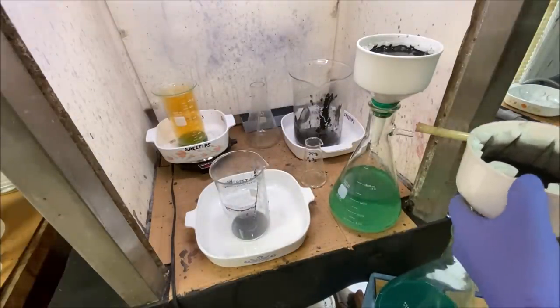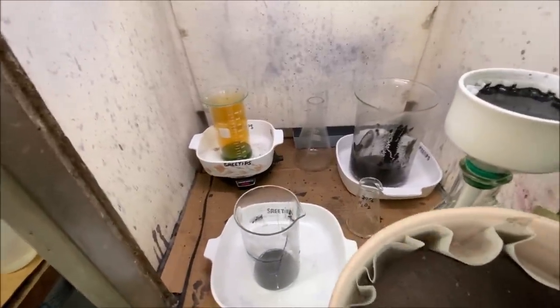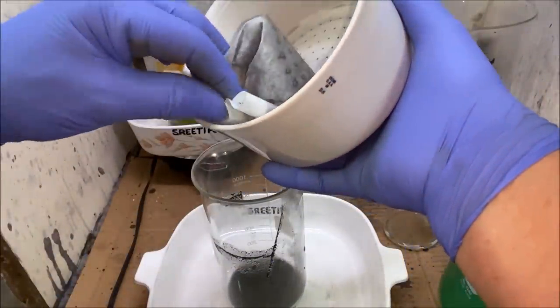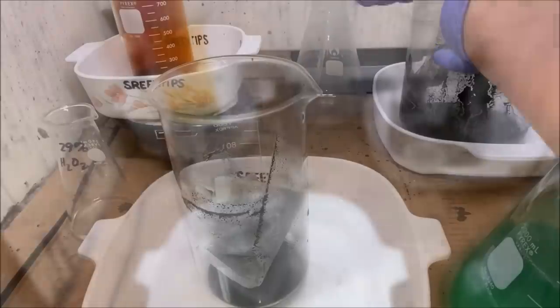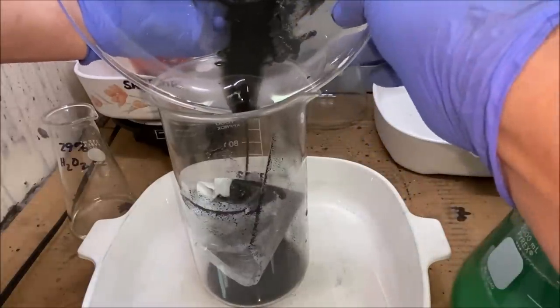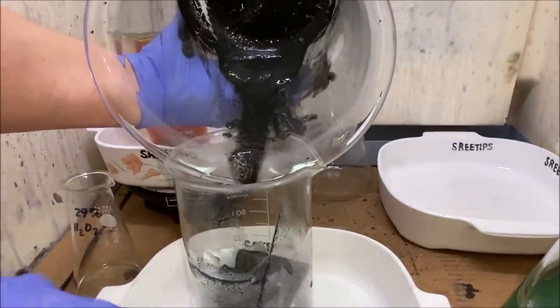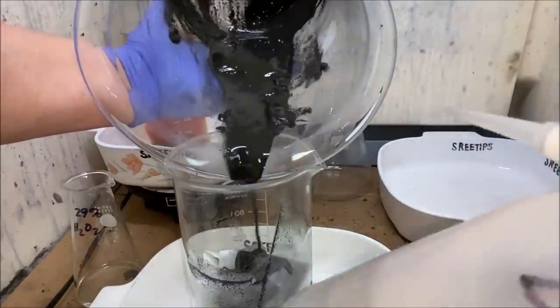What we're going to do is add this filter paper and all right down here into this beaker. And we're going to treat the whole filter and the solids in there with our Piranha solution. I'm going to add a couple of scoops of this black material. You know what? We're almost done here with this. And I don't have very much up here left. So we're making some decent progress here.